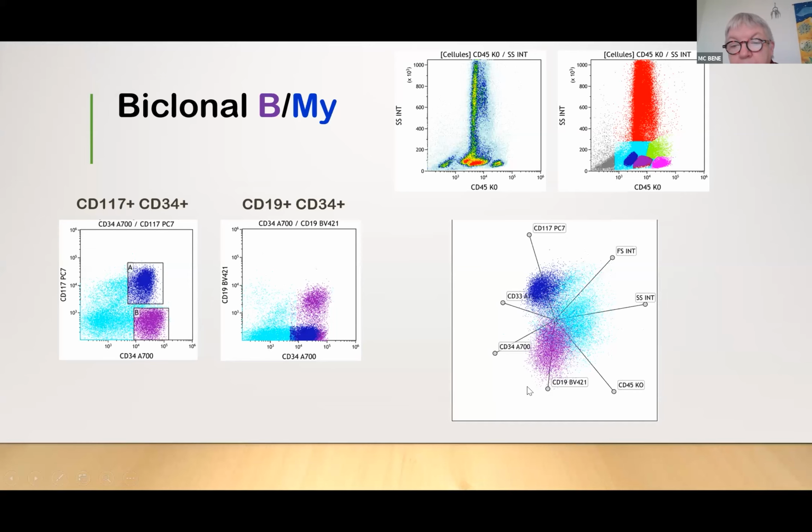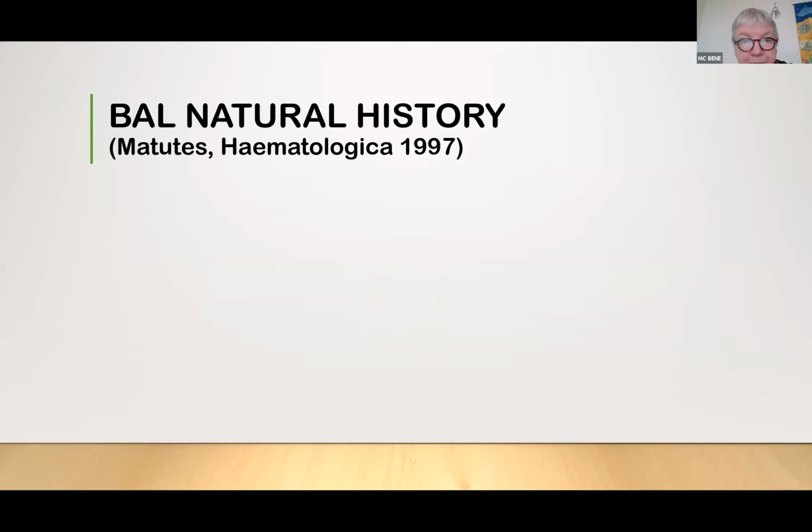And you can also use the radar display to show that these two clones are really definitely distinct and separated by their size and also by their markers.